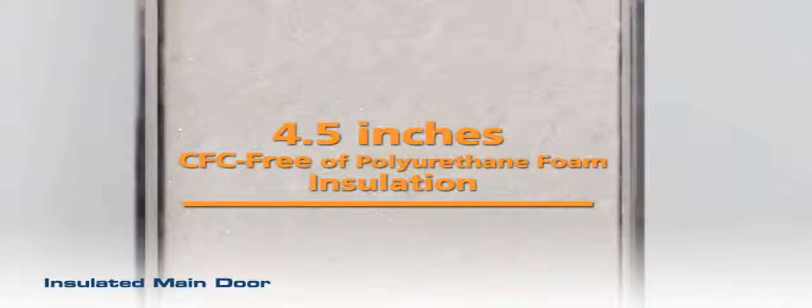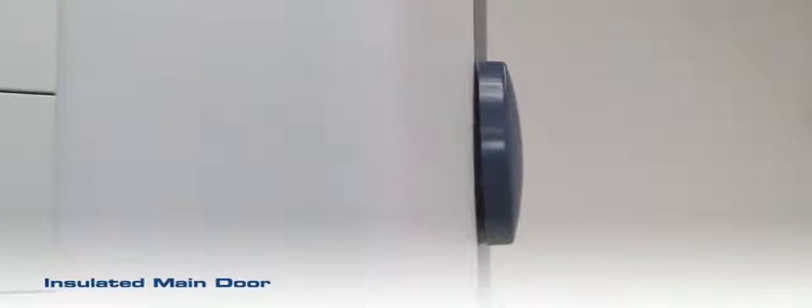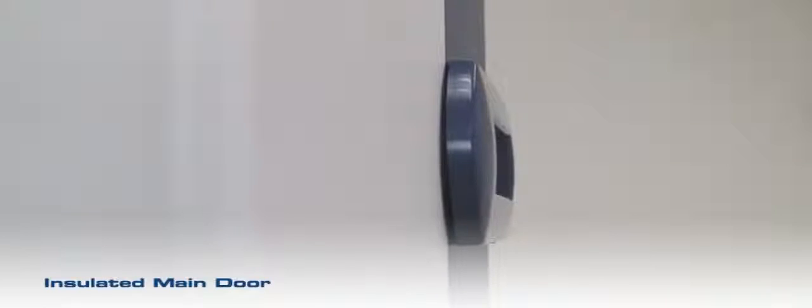The outer door is sufficiently insulated with 114mm 4.5 inches polyurethane foam. Three durable hinges are used allowing a 180 degree opening of the door and easy passing of the unit through doorways.